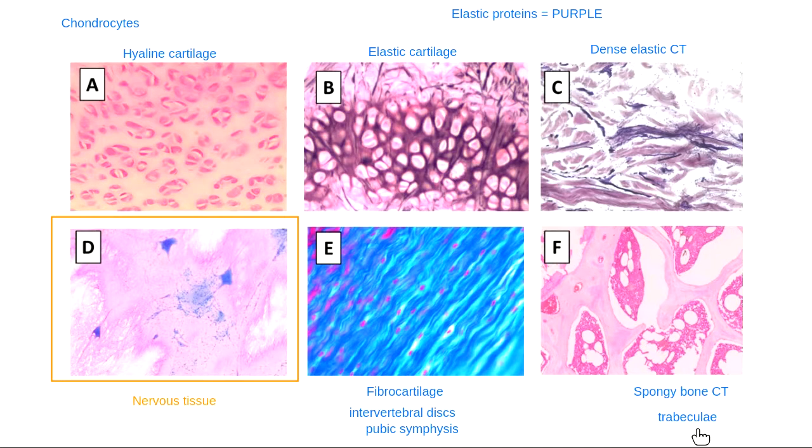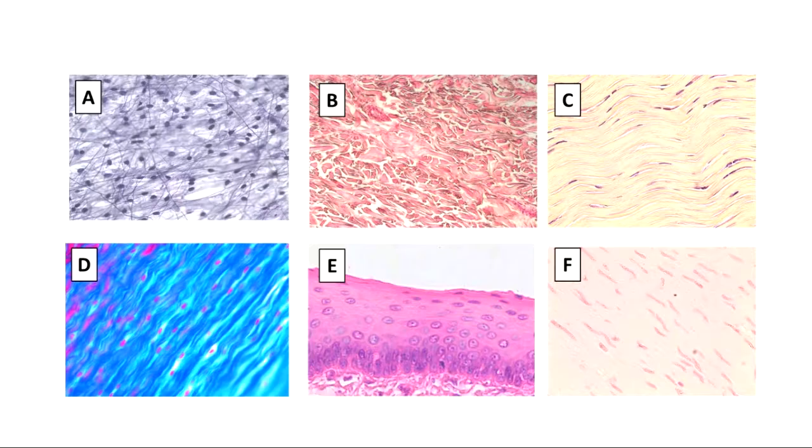All right, I got one last set of tissue images for us to look at together. Here's my last one right here. We have talked about all of these types of tissue. So this could get super crazy, but I don't even care. Up above my pointer right here, there's a little T. I want us to take a stab at labeling these types of tissue.